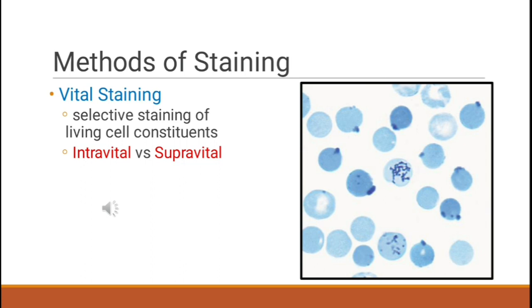Shown in the picture are reticulocytes and our Heinz bodies stained with supravital stain using our new methylene blue stain. So this is a peripheral blood film under oil immersion objective. The methylene blue dyes called nucleic acid stains or vital stains are used to differentiate and count these young red blood cells. Vital or supravital stains are dyes absorbed by the live cells.